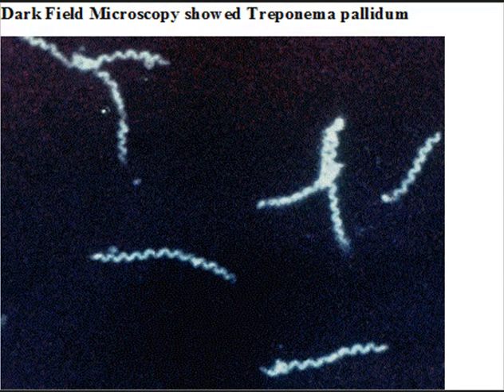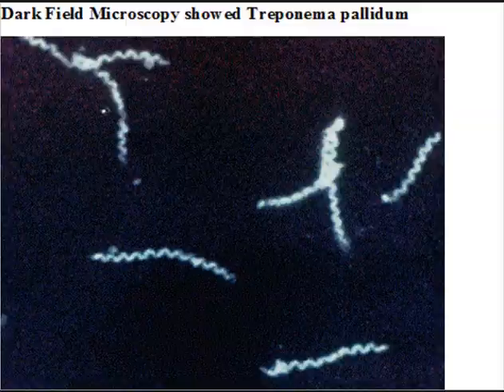So here, under the dark field microscope, we have your Treponema pallidum, again the causative agent of your syphilis. Syphilis is a very well-known sexually transmitted infection, STI, STD. Okay, so that's it for your dark field microscope.